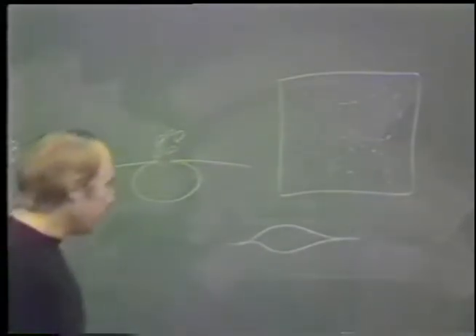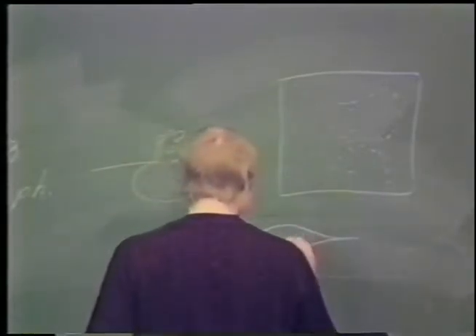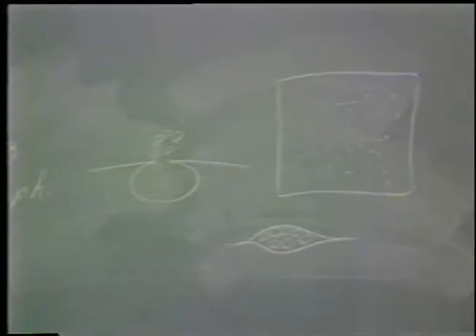And it can also lead to the formation of multivesicular bodies in or near the plasma membrane. Again, in some cases these are real, but we're going to have to take a look with ultrarapid freezing techniques and find out which are real and which are fixation artifacts.